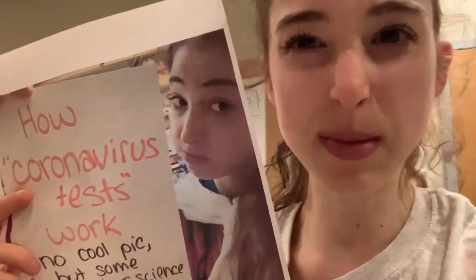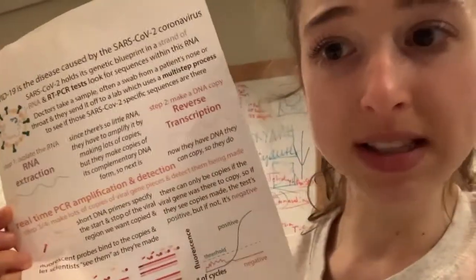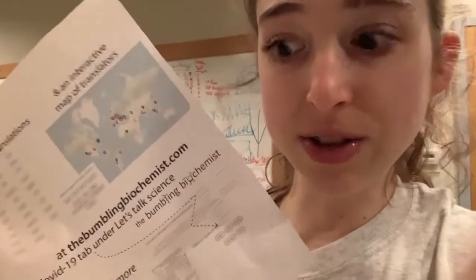One of the first posts I did on the coronavirus was this post describing how the test for the coronavirus works. So I'm talking about the classic RT-PCR tests. Sometimes they're called molecular tests, but these are the tests that look for the viral genetic information. I did this post, and then it was really awesome because the IUBMB, the International Union for Biochemistry and Molecular Biology, helped me find translators from around the world to help translate my figures and some of the text into 30 languages that I now have on my blog.